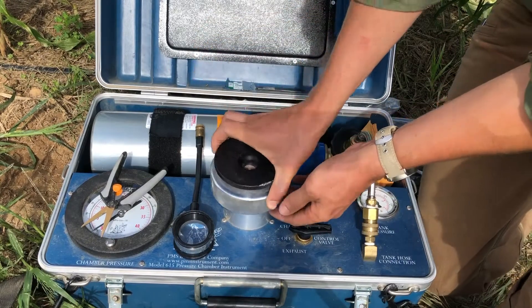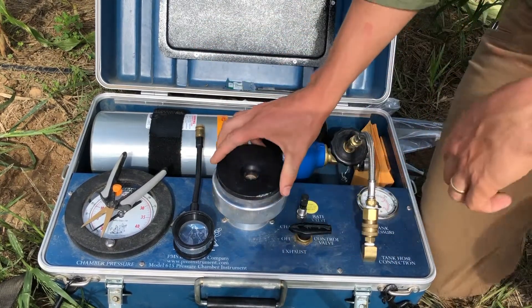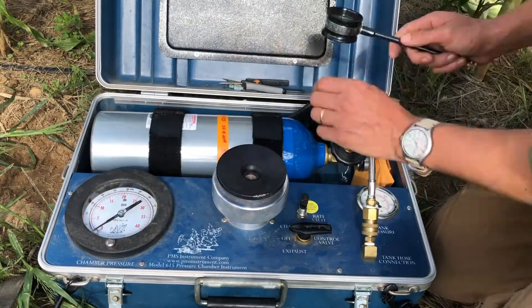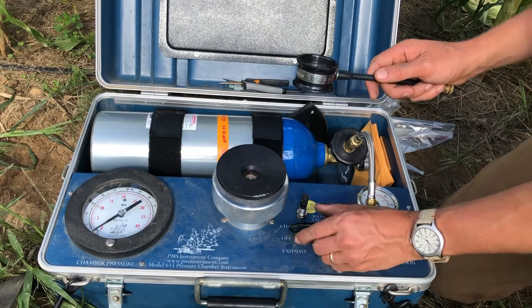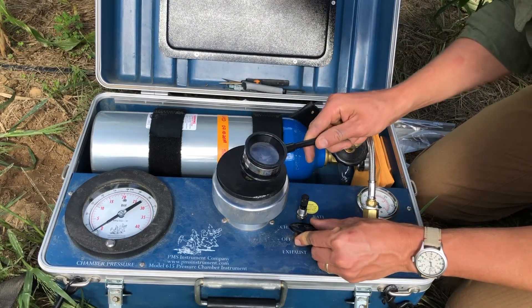To help us better understand the mechanisms of drought adaptation that may exist among the different varieties we're evaluating in our drought trials, we can utilize metrics like leaf relative water content. While measurements of water potential determined from a pressure bomb are useful in understanding the degree of water stress plants are experiencing, as well as for addressing questions relevant to water transport in the soil-plant-atmosphere continuum, measurements of water potential do not account for osmotic adjustment under drought.